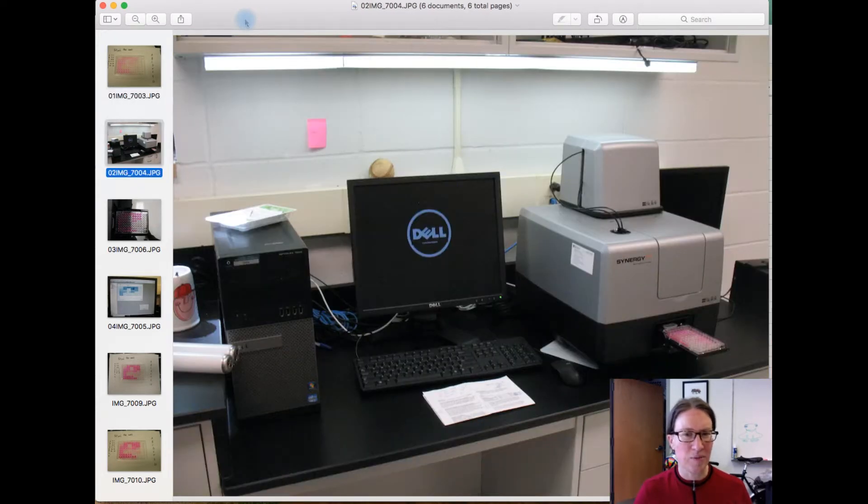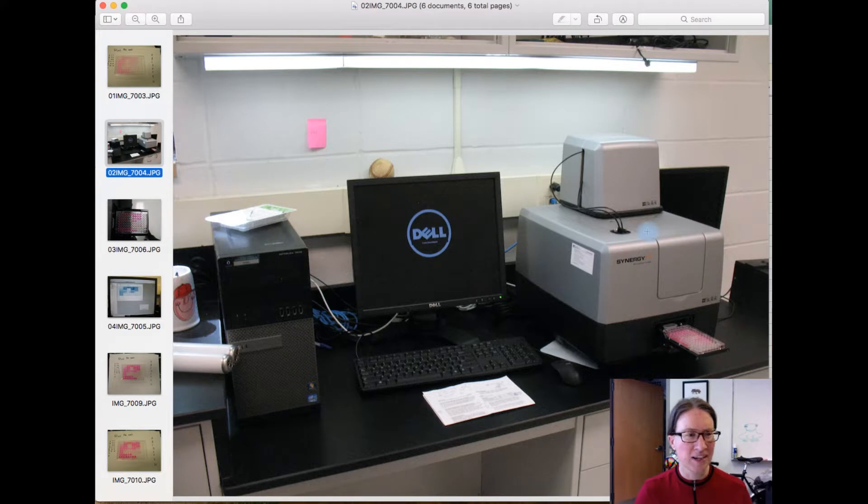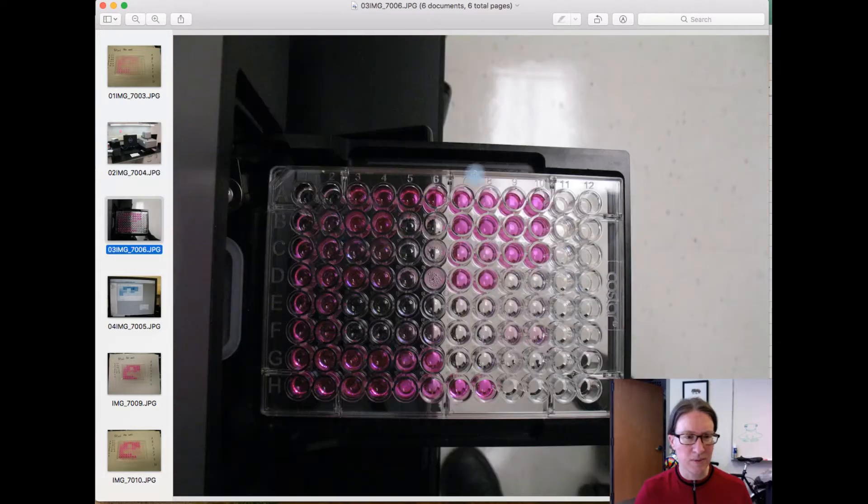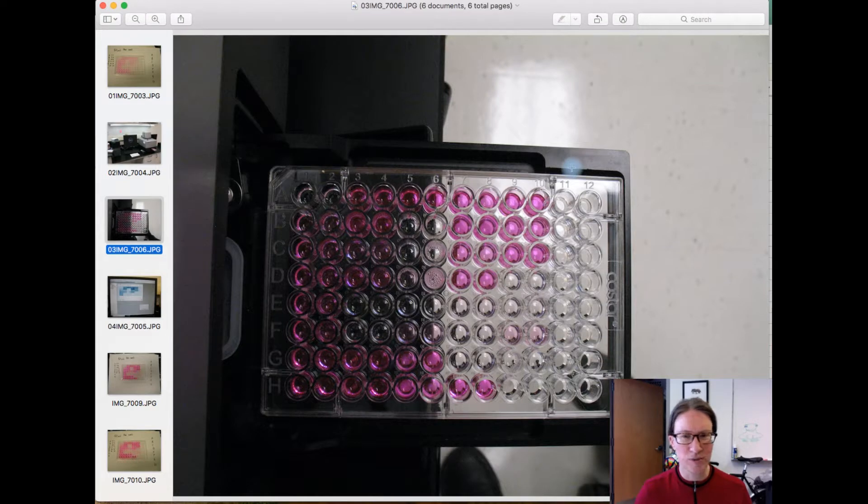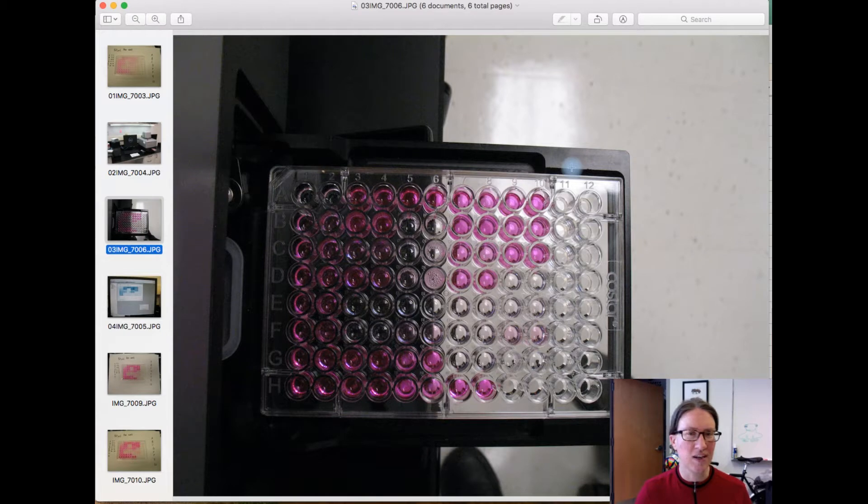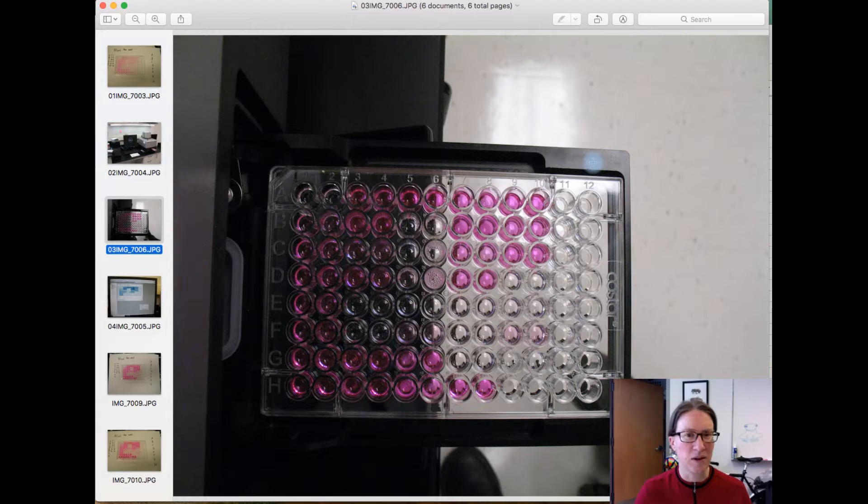Here is our microplate reader, it's this box over on the side. It might not look like much but it has a lot of instrumentation inside, it's a very expensive piece of equipment, and we were really excited to get it just a little over a year ago. So I put the plate into this holder, and then it gets slurped into the machine, and I set the machine to incubate it at 37 degrees for 30 minutes, so that higher temperature will speed up the conversion to allantoic acid, and then had it read at the appropriate wavelength.